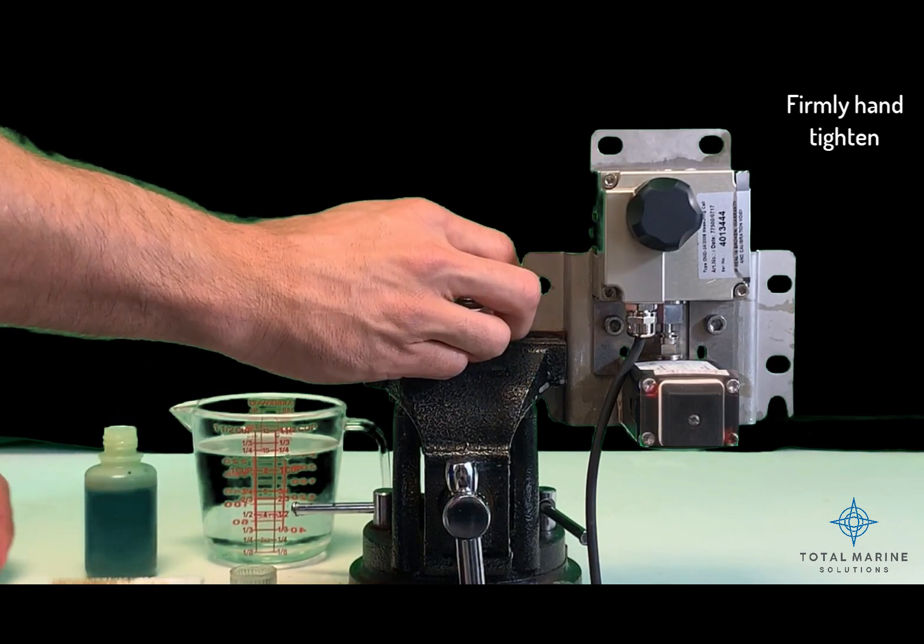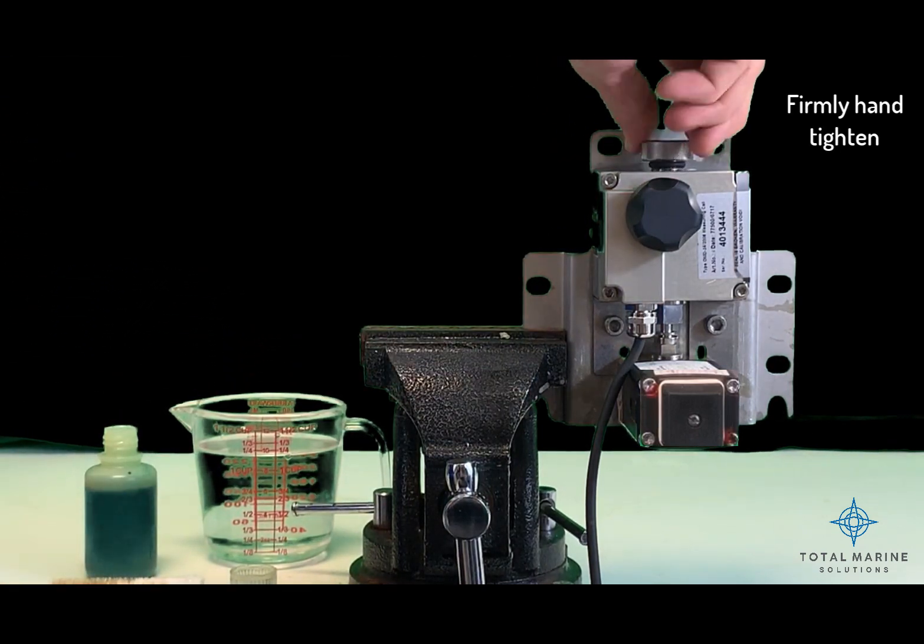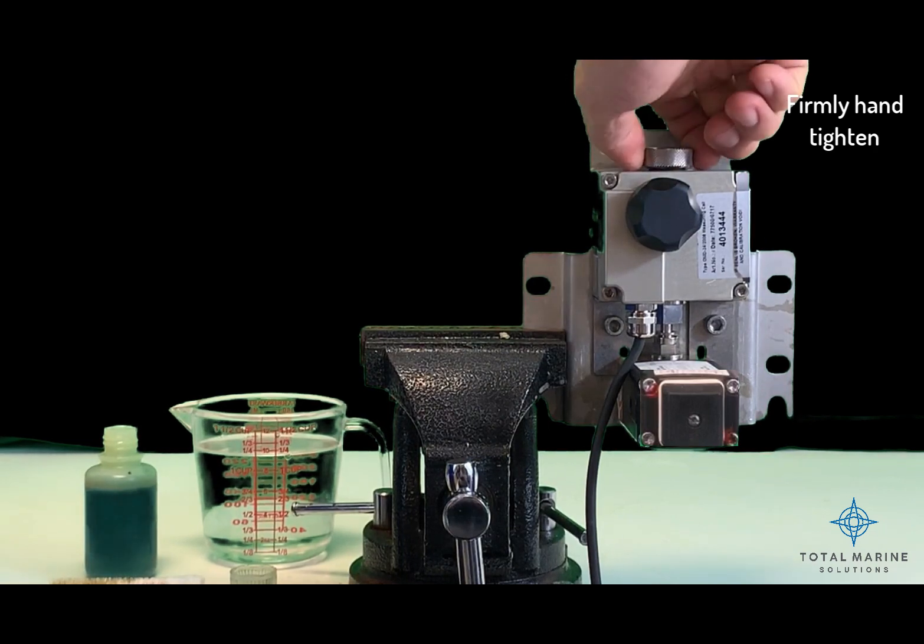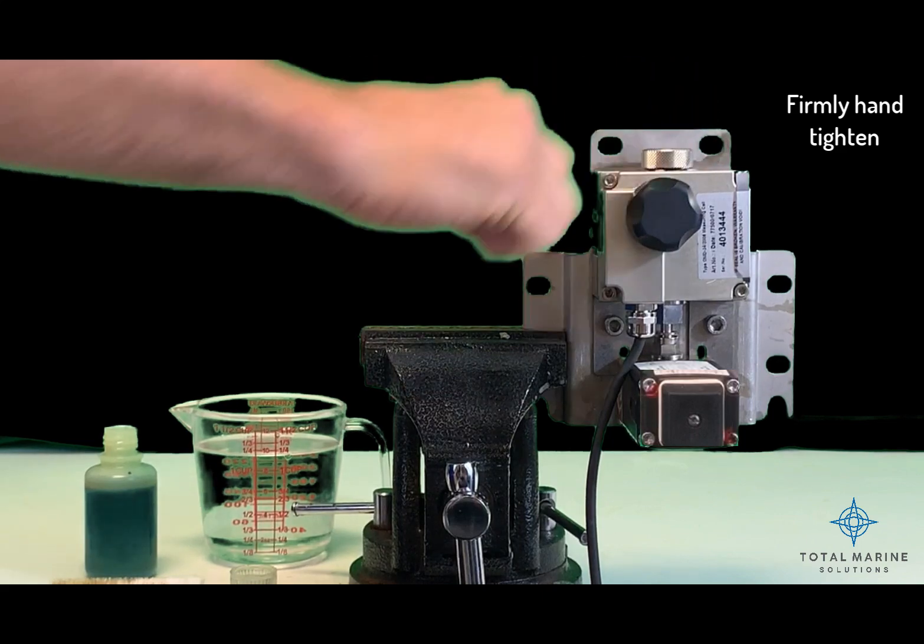Replace the cell cap. To avoid air bubbles in the stream, make sure to screw down the cell cap tightly. Be sure to only hand tighten the cell cap.